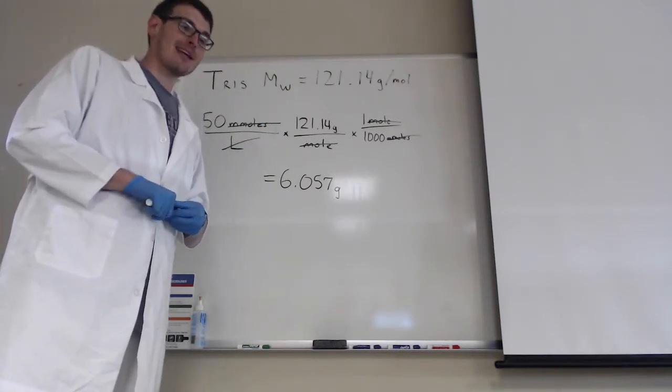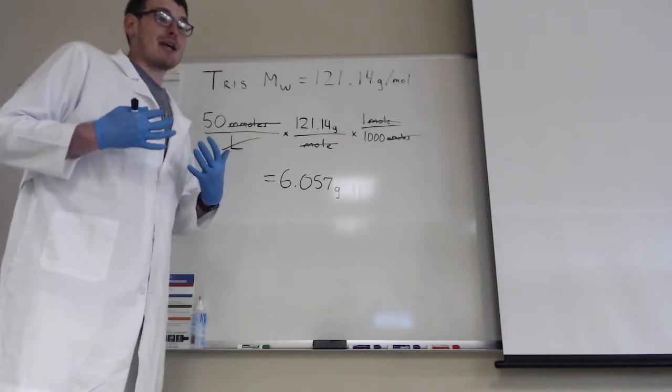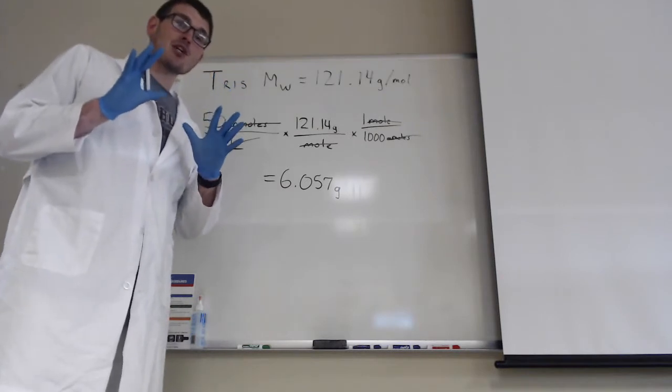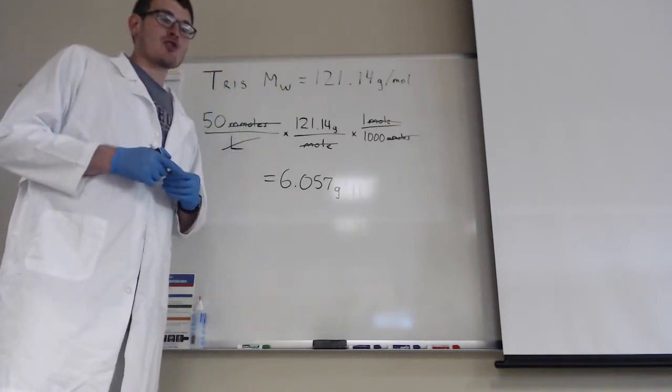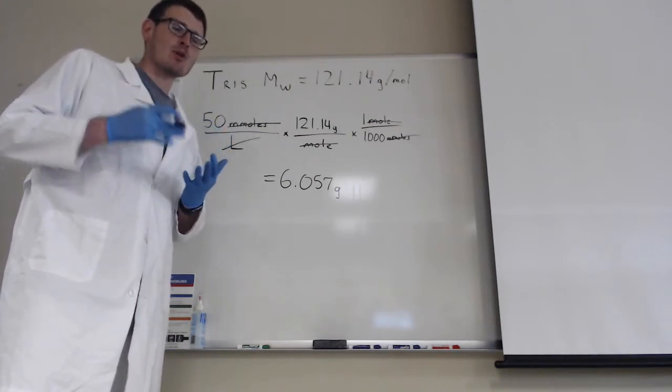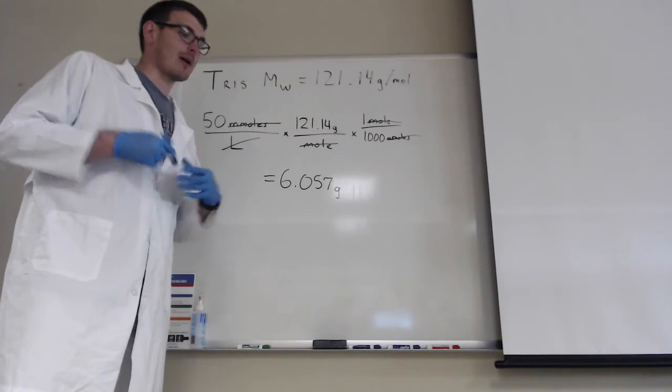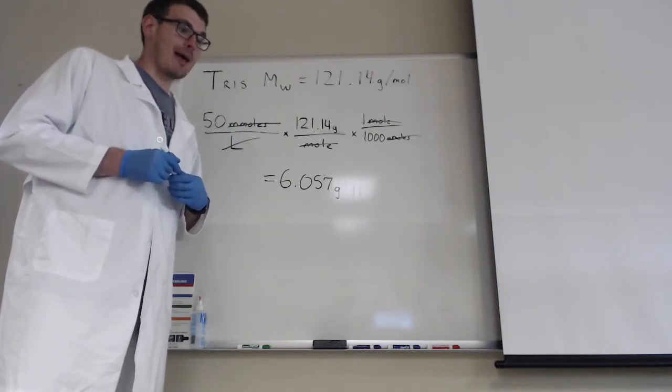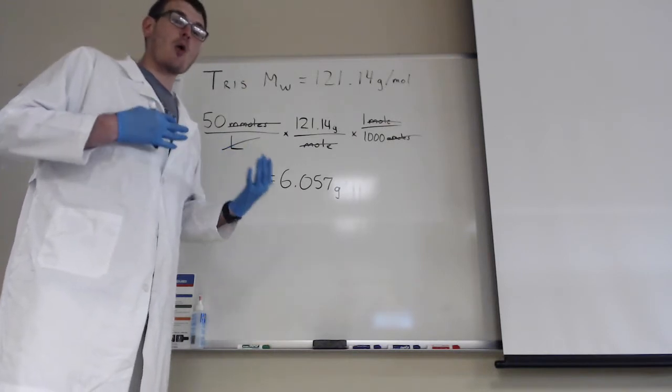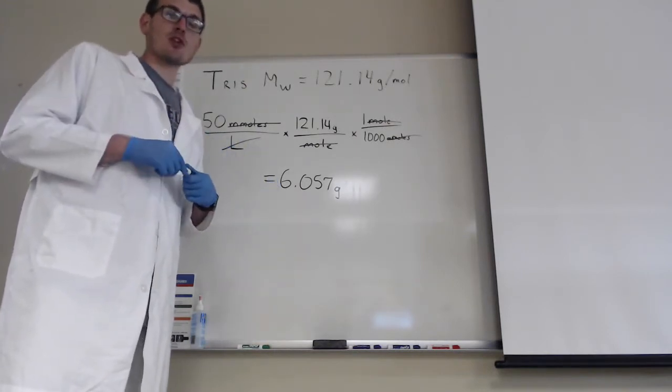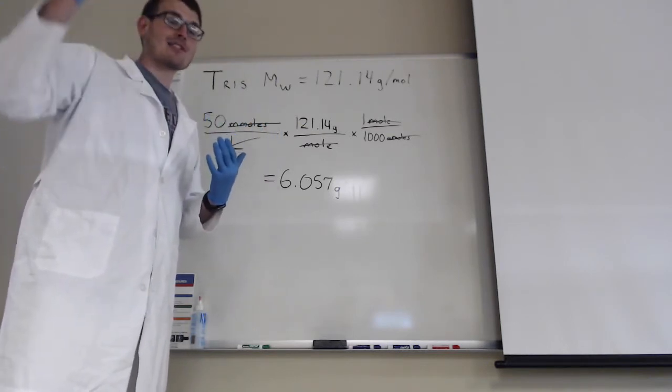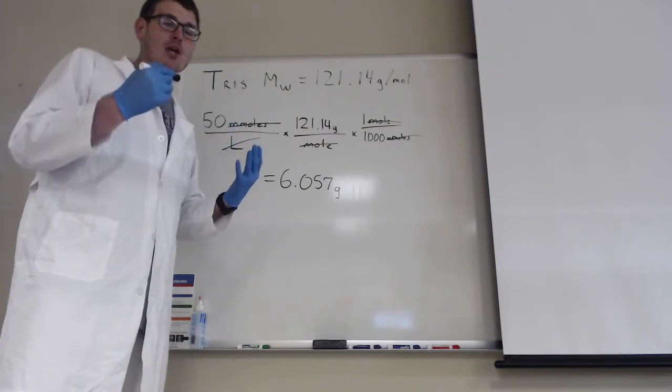So just a little over six grams we need to weigh out. We're going to dissolve it in a little less than a liter of water, maybe seven or eight hundred milliliters. The thing we need to make sure we do here is we need to get the pH right. In order to get the ion exchange chromatography to work as best as it possibly can, we need the pH to be right at about eight. Tris is a fairly basic compound, so I would expect the pH of the initial solution to be well above eight. So we're going to need to pH it down with hydrochloric acid to get it down to eight.